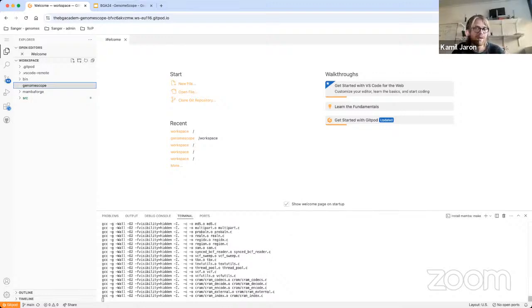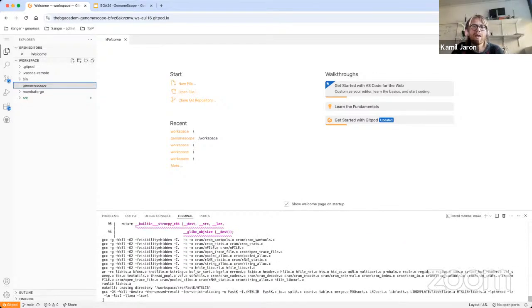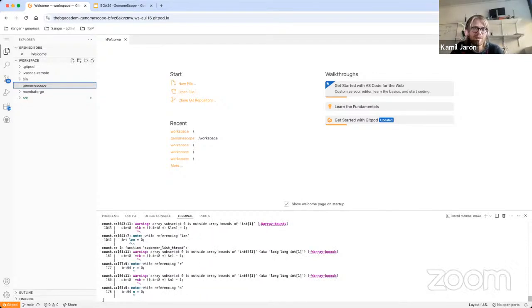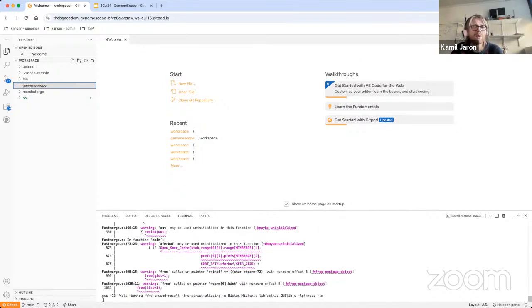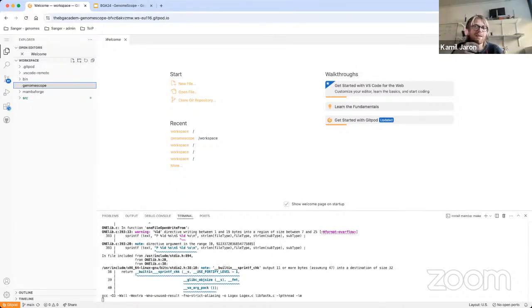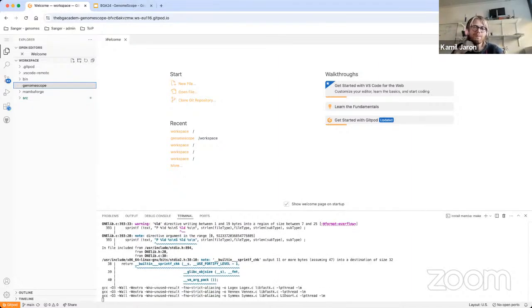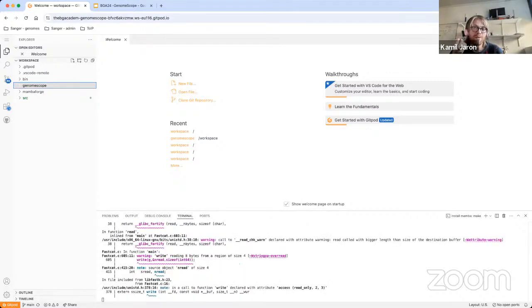So if you're struggling with coverage, you just go low. If you're not, then just go for the default 31. Actually, for PacBio, my default is usually 31. For Illumina, 21, just because the choice of K affects Illumina more. But you don't overthink it. It actually doesn't matter. It should not matter.